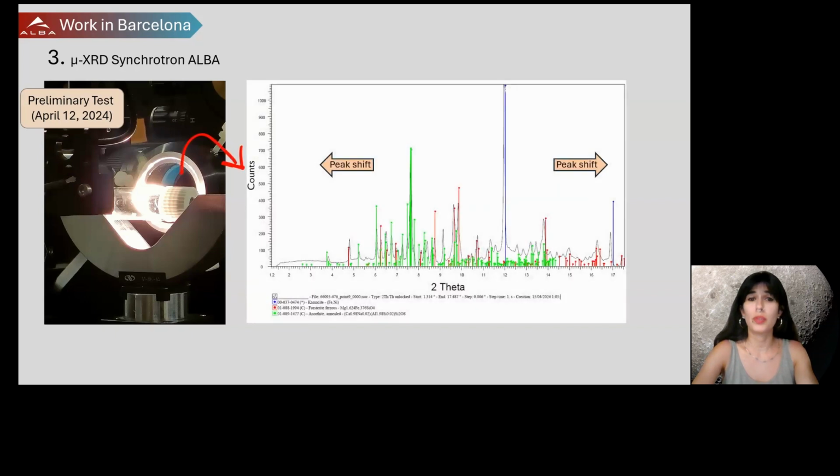We did see that it was diffracting very well, and the peaks were fitting very well at the center of the diffractogram. However, they were stretching in opposite directions at the edges of the diffractogram, due to the glass. This was the contribution from the glass.